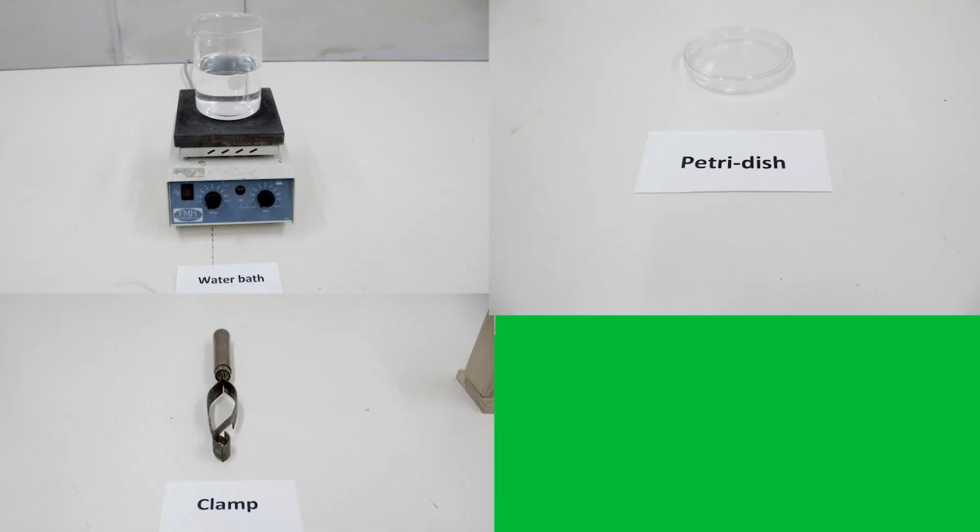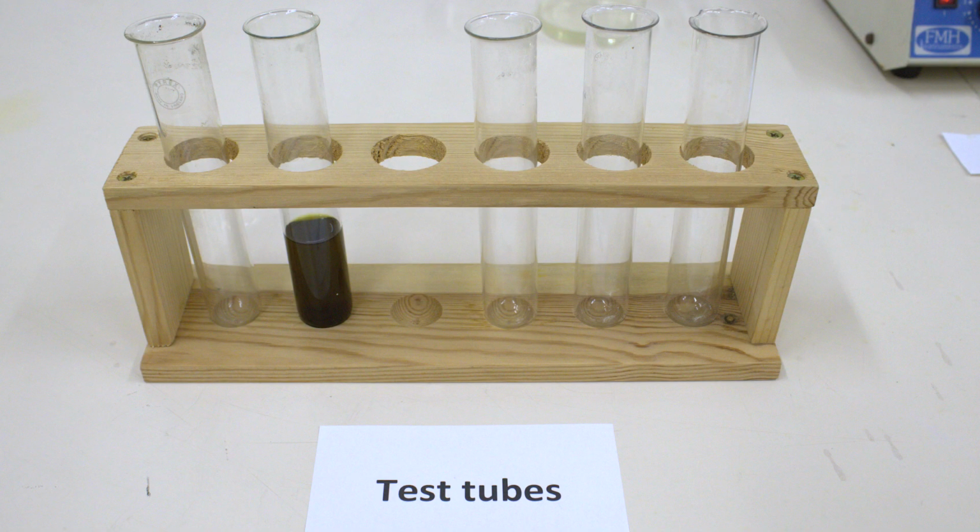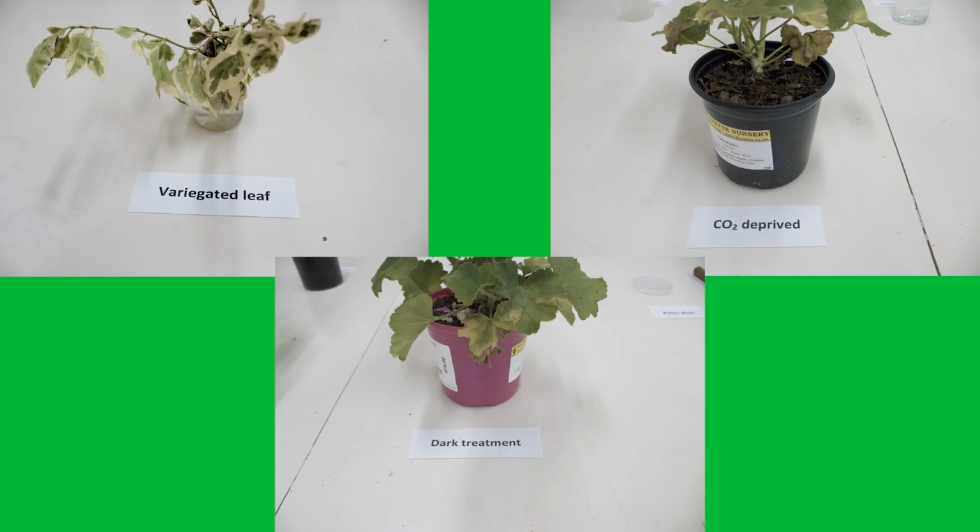You will need a water bath, a clamp, petri dish, a pipette, ethanol, iodine, forceps, water, test tubes in a test tube holder, and you will need plants that will receive 3 different treatments.